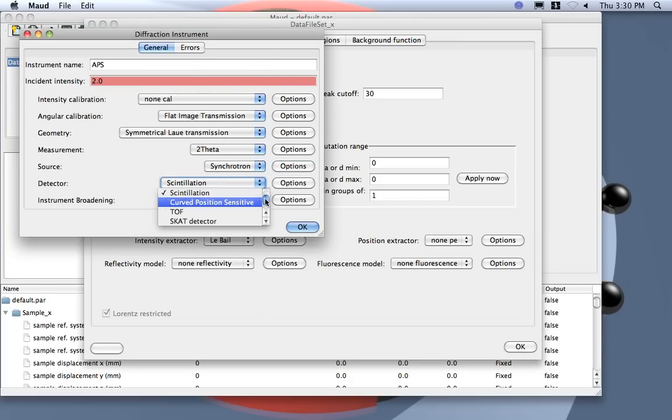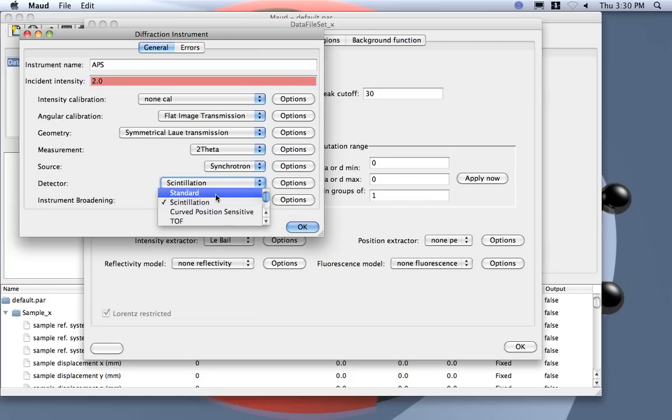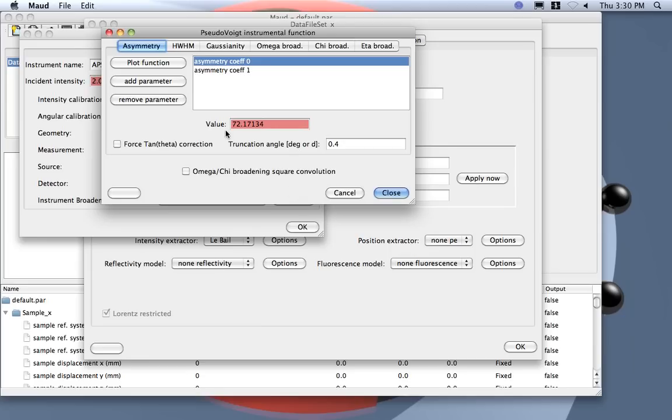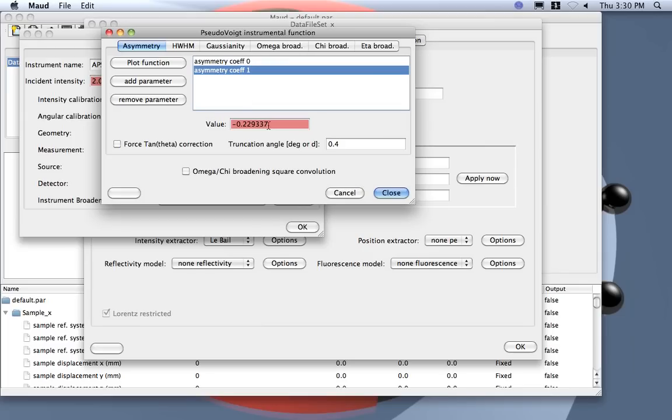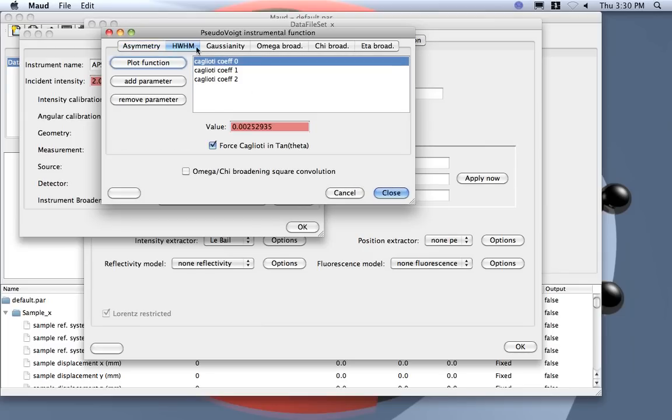We actually, inside we put standard, it's actually no use. And instrument broadening, for example Cagliotti could be... this was for the Bragg-Brentano, remember. So actually what we do normally in transmission we don't have asymmetry or we will check later if we have. So I put everything zero here.